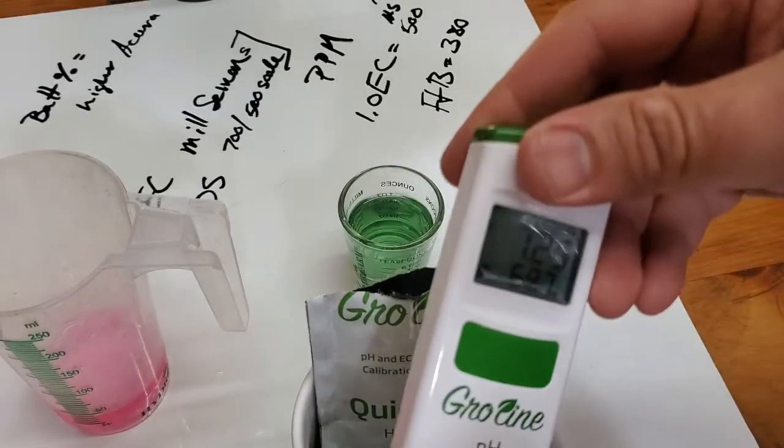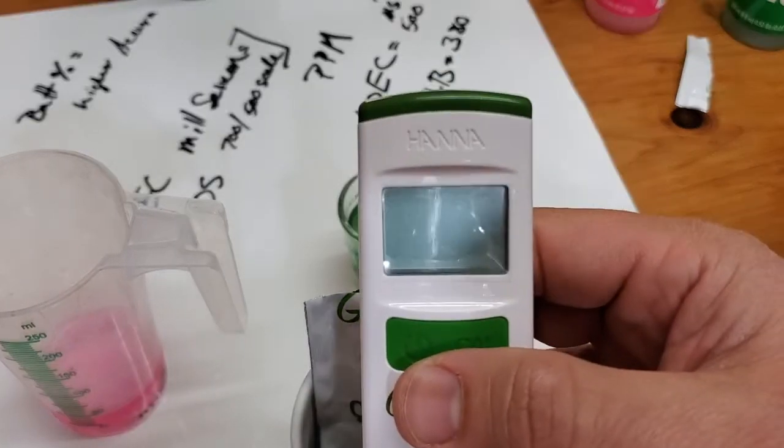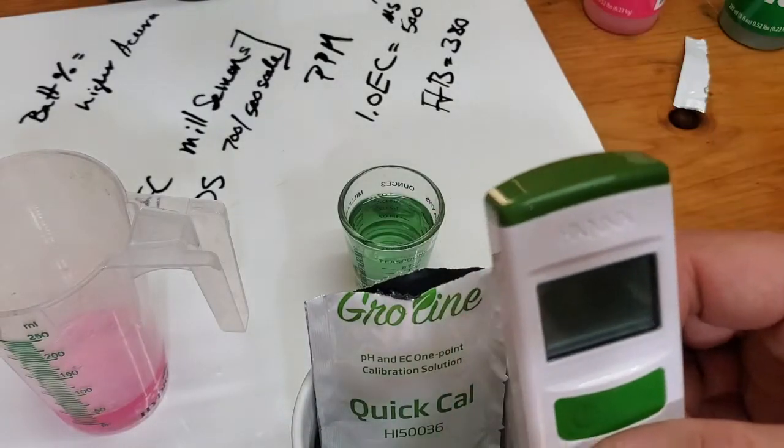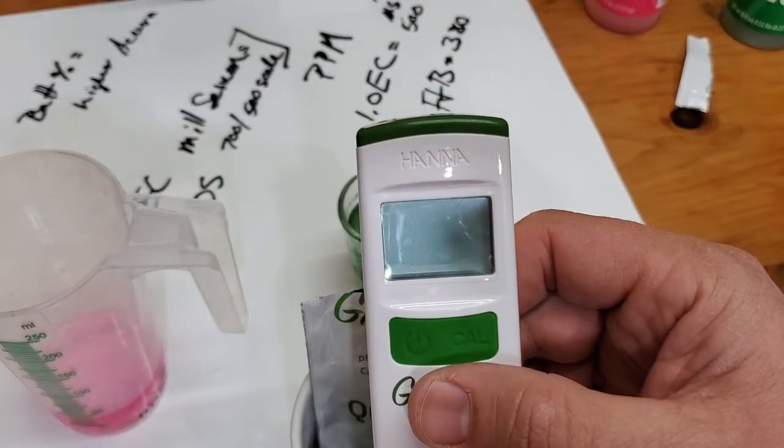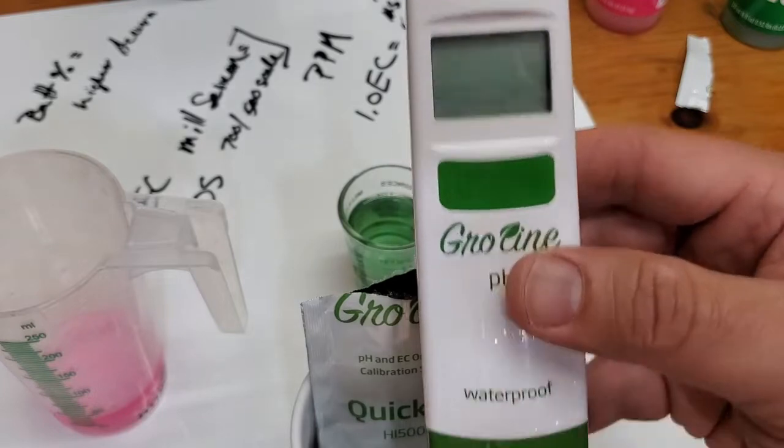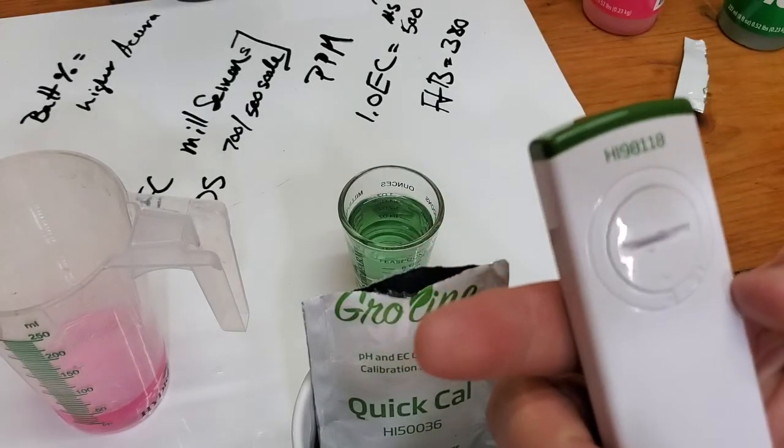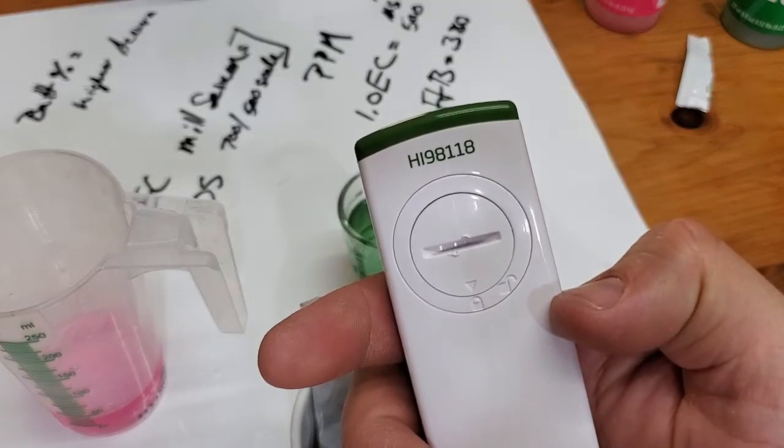After that, get some storage solution, put it in here, ready to go. Doesn't get much easier than that. You got to get used to the Quick Cal solution, have it on hand. You'll want storage solution and cleaning solution on hand as well. But this thing is waterproof - you just throw it in and it's gonna do what you need to do. There it is, the 9811-8.